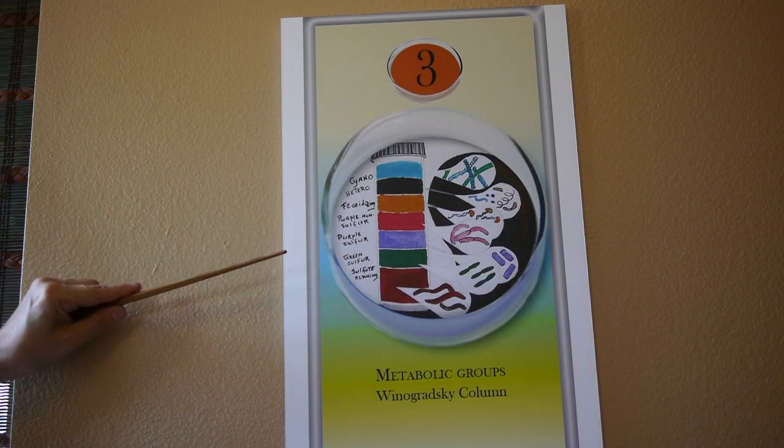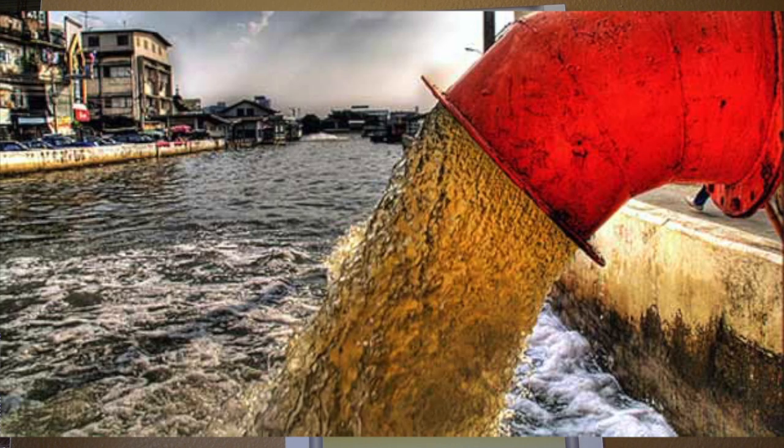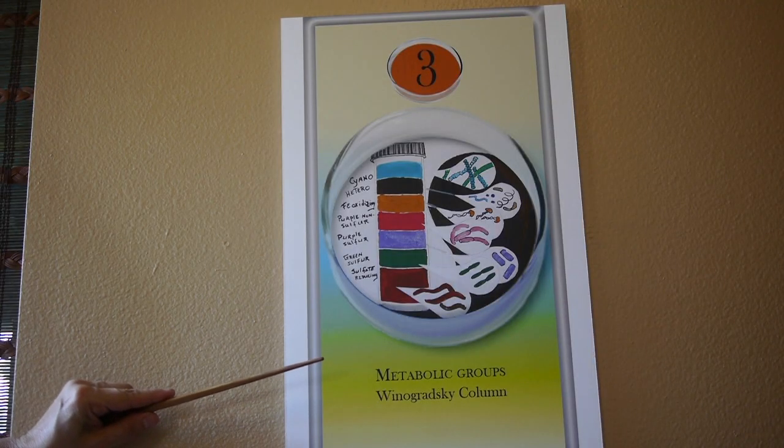This microcosm will give you an intimate understanding of how our land and seas change by the addition of external materials such as pollutants, and shows how the microscopic biota responds to such perturbations.